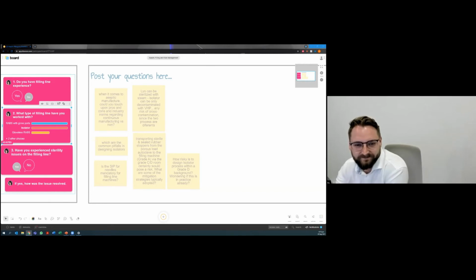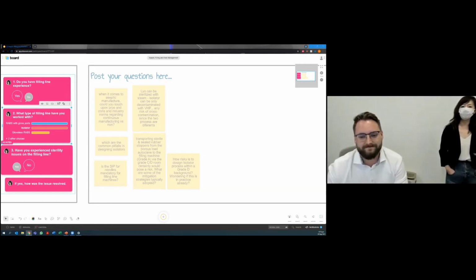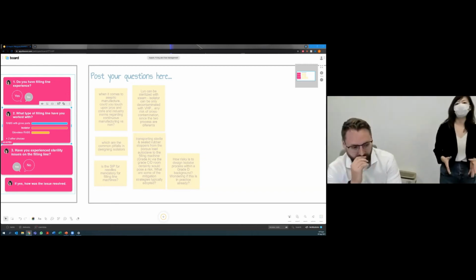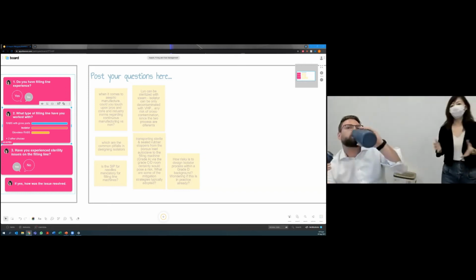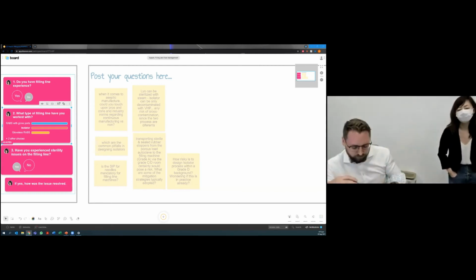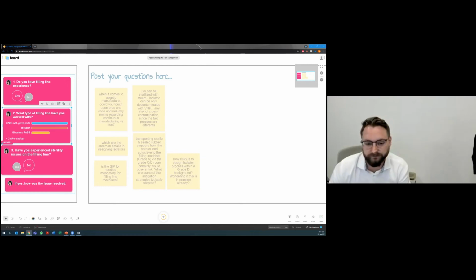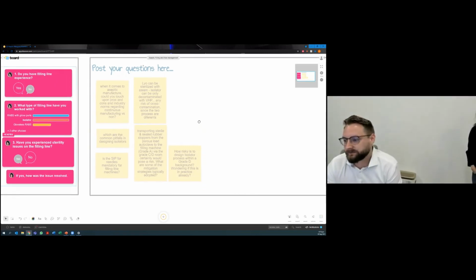Can I ask? Yes, and Chan has just joined me here as well. Just to follow up on that question: in aseptic, normally at the end of the batch we do active air sampling. We don't want to do that in between the batch because that will interfere with your airflow. So we do it at the beginning of the batch and at the end of the batch. Just curious, if you do continuous, when do you do the active air sampling? That's a good point, yes. Okay, we can take a look at the next one here.